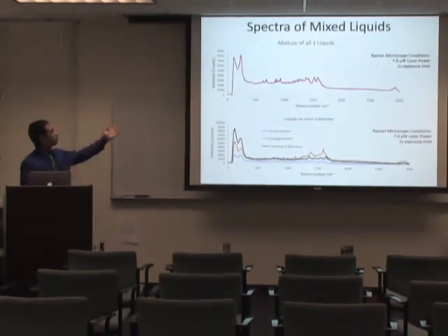So on the top one, we see this is actually a mixture of all three liquids together. As I mentioned before, blood samples and breath samples contain more than one ketone. It's actually a mixture of many ketones. So to better mimic that, I did a drop and dry technique on the top graph, and I got this complexity of a graph. And now this is good. We want this so we can better understand what we need to look for in the future.